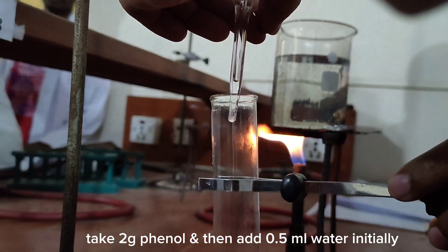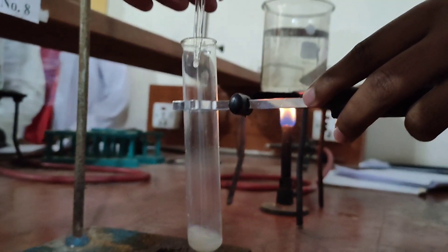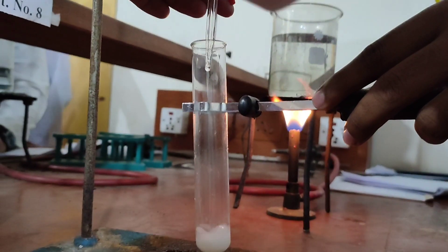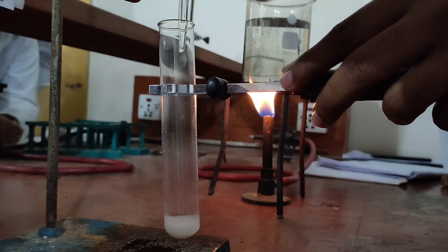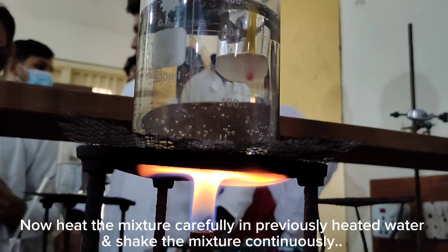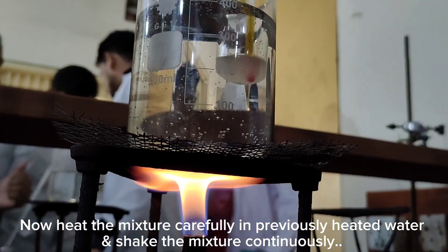Take 2 grams phenol and then add 0.5 milliliter water initially. Now heat the mixture carefully in previously heated water and shake the mixture continuously.